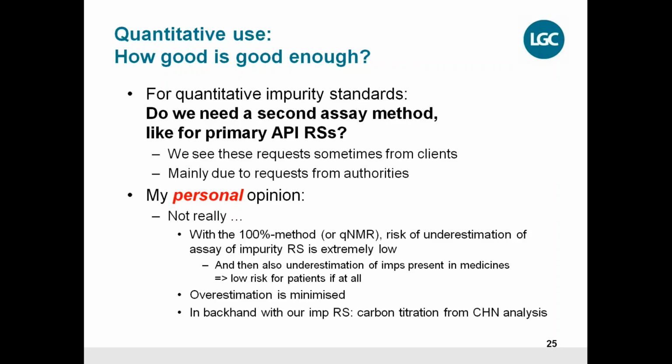However, if a customer really wants to see a second assay method for our impurity reference standards, then we put that on the certificate, of course, as well. Our primary API reference standards, which are not a topic of this presentation but will be for further webinars, definitely already have a second assay method, because that is common sense.